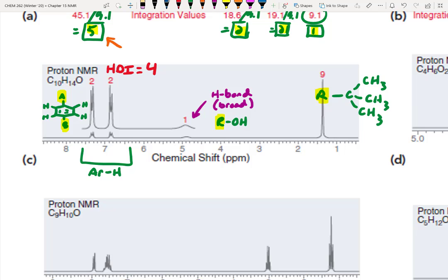All right, so now let's try to figure out what's going on. We've got 6 carbons in the aromatic ring. We've got 4 carbons over here. So it looks like we've counted all our carbons. Do we have enough hydrogens? Yeah, I think we counted all the hydrogens. We counted the oxygen, right?